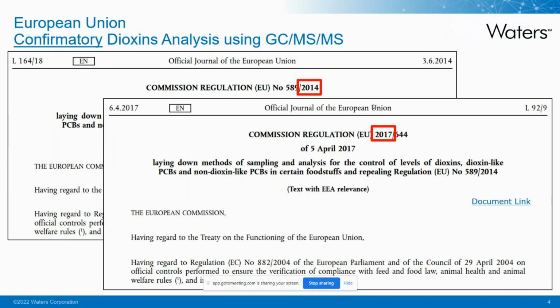So again, I'll point out the main change here was to go from magnetic sector, which tends to be a large floor standing instrument that requires high expertise in the operator, to benchtop systems on EI and atmospheric pressure GC-MS that are easier, smaller, and less expensive to operate.